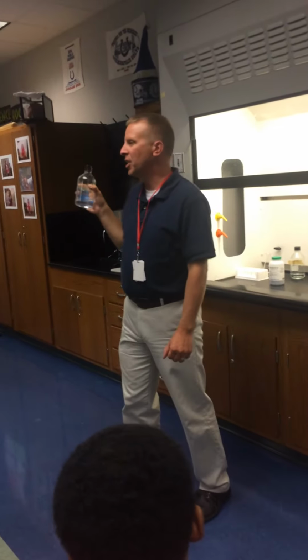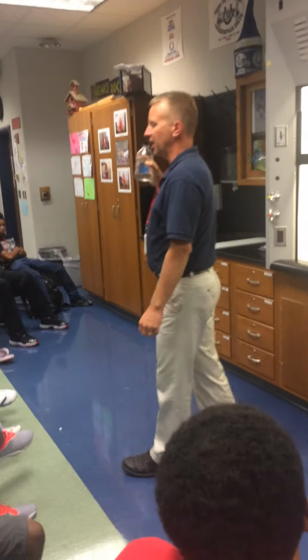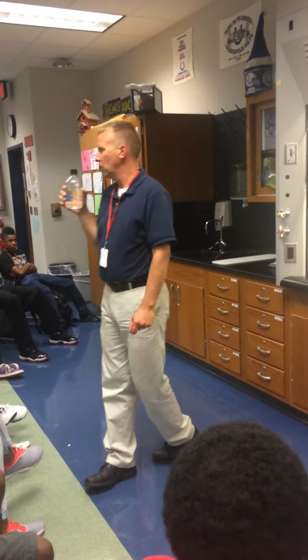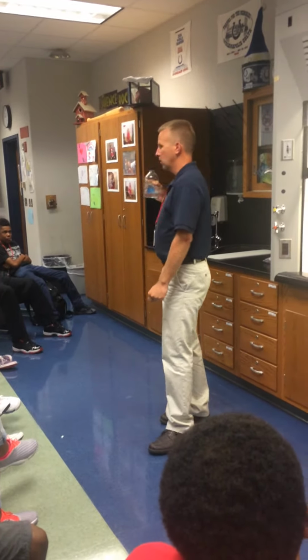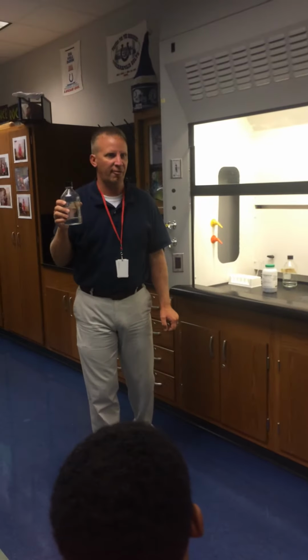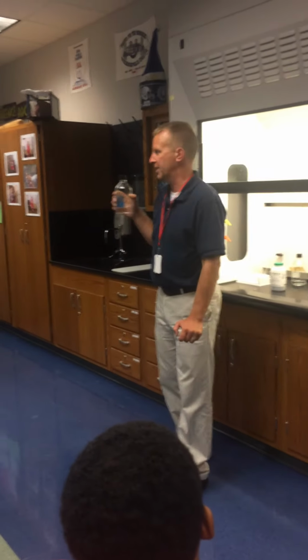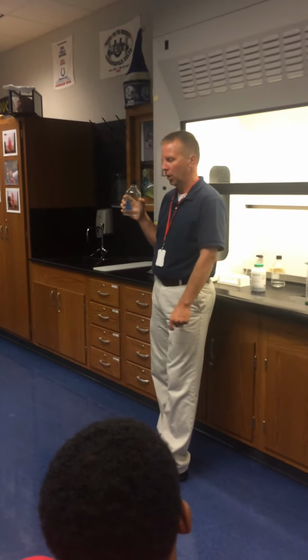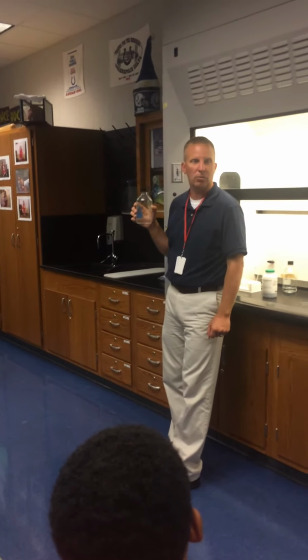Guys, the stuff that is in here is an extremely volatile liquid. What I mean by volatile is it reacts with stuff and it gets a little nasty. So much so that if I drop it on the floor, it will eat through the tile.